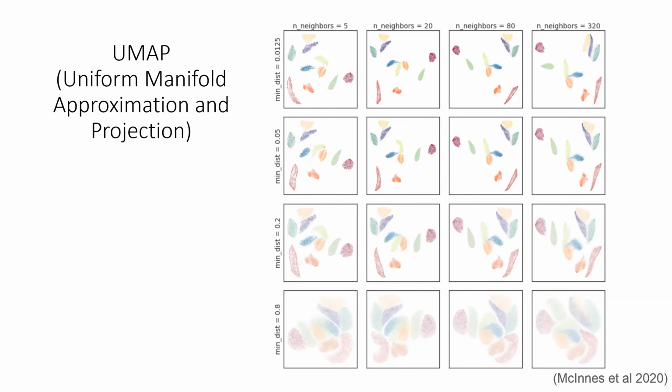But everything we're talking about today is just to prepare the data for clustering. We don't actually use transformed counts when we make quantitative measurements of gene expression.